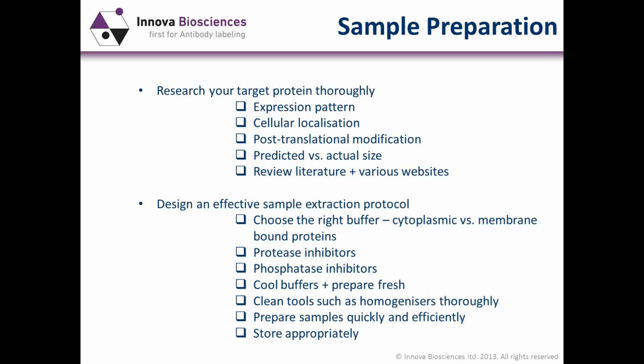What I mean by this is have all your buffers clean and prepared, fresh, sitting there on ice, ready to go. It's pointless trying to make a buffer partway through an extraction process. You're just wasting your time. You want everything to be, as I said, fresh, but not that fresh. You also want it to be pre-cooled.